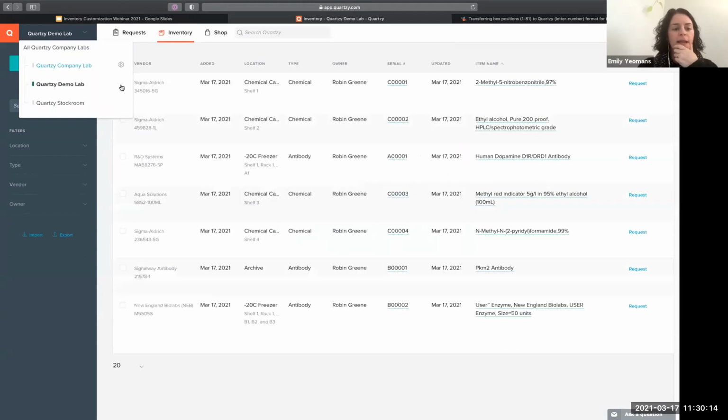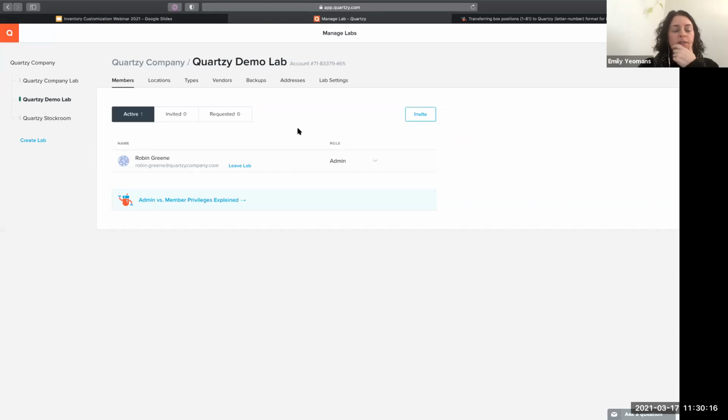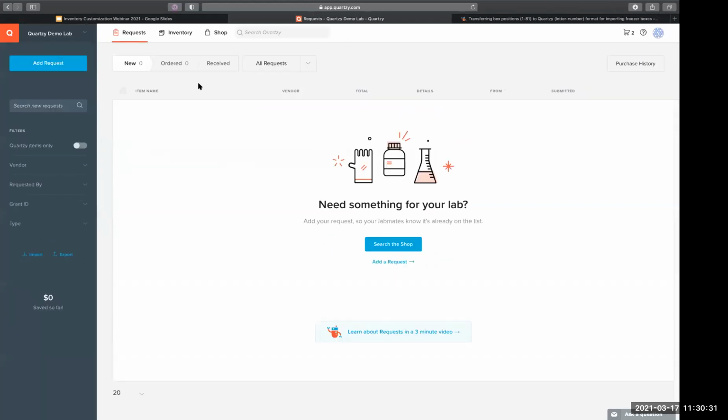Perfect. And then another question, these are awesome questions, everyone. Is there a way for Quartzy to autofill the CAS numbers for the chemicals? Is that something that we do when chemicals are purchased through Quartzy, Katie? So the CAS numbers are not automatically added, but we are currently working on getting to this.